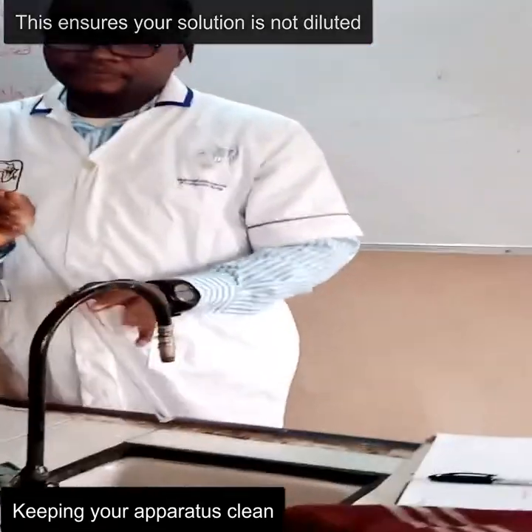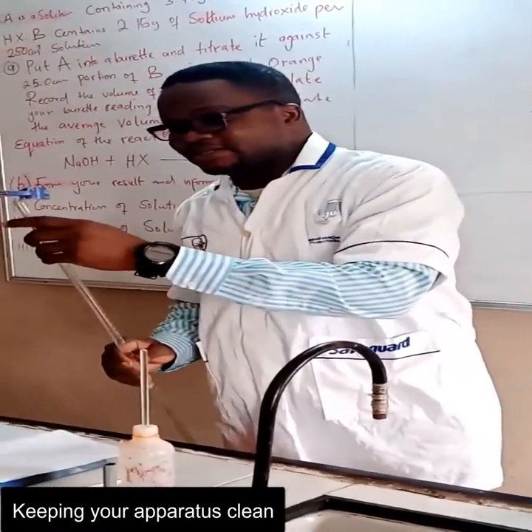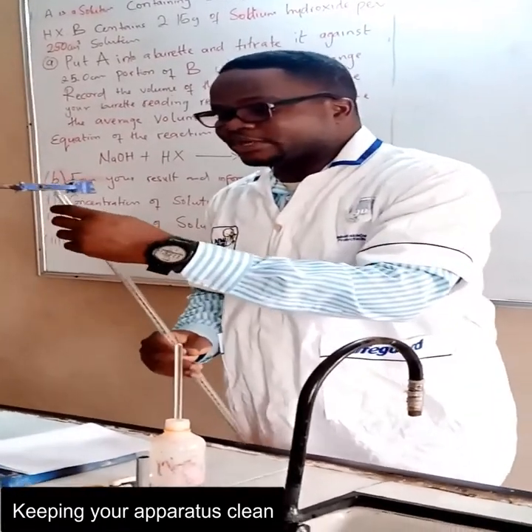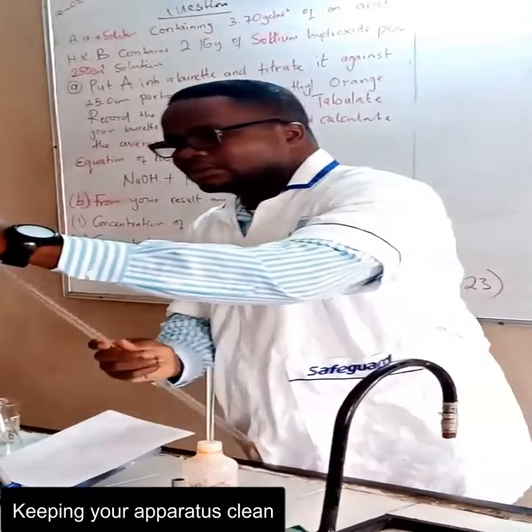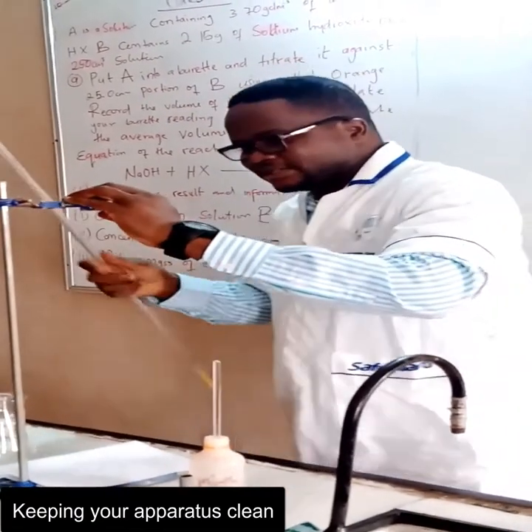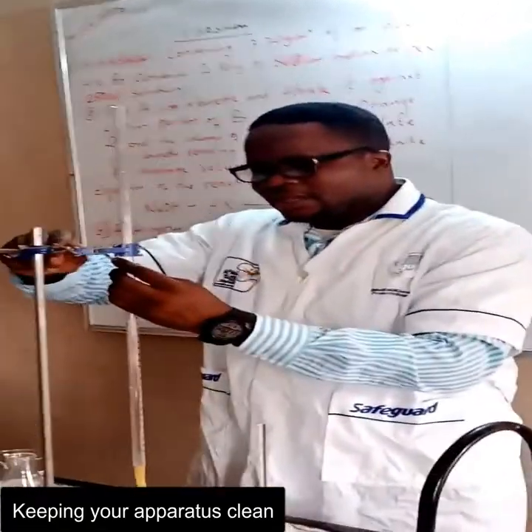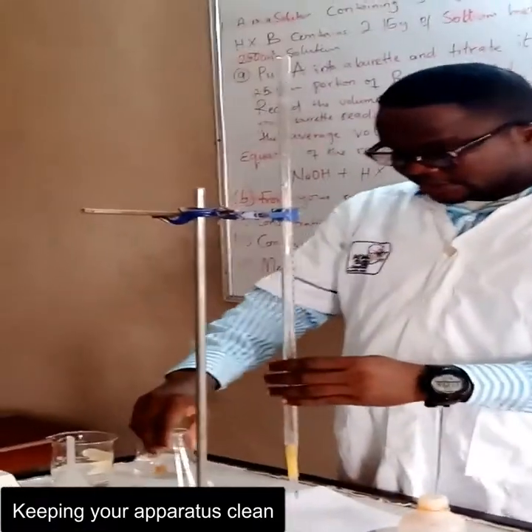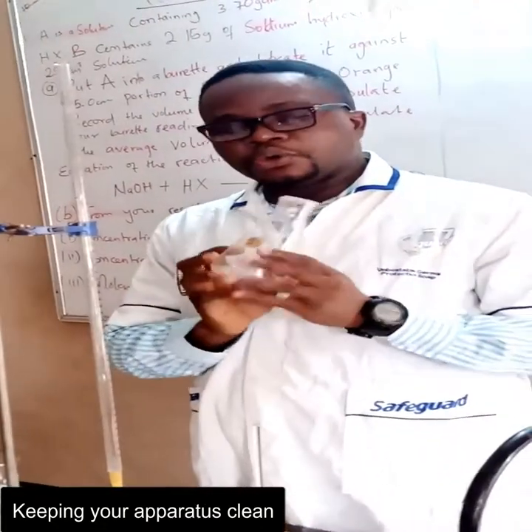Under question three, they ask questions on the management of apparatus. That's the reason why you rinse your buret with the acid — because the acid is the solution that the buret will have to hold. Apart from rinsing the buret, we'll also talk about the conical flask.